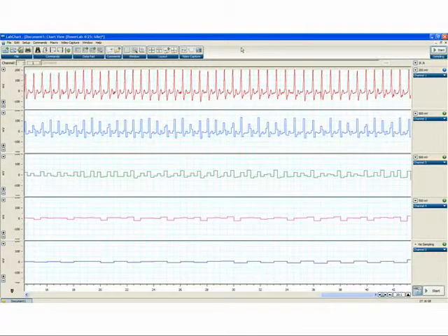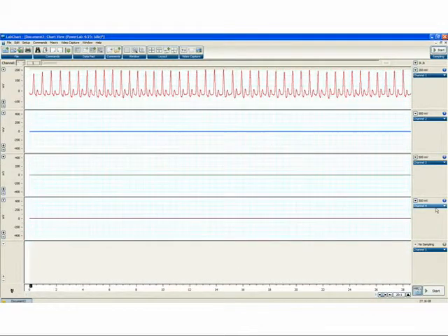One of the latest features of LabChart version 6.1 for Windows is to perform signal averaging, either by number of samples or by time. Signal averaging can be performed using the smoothing feature from channel calculation or the drop-down menu of each channel. First, we'll start with signal averaging by the number of samples.